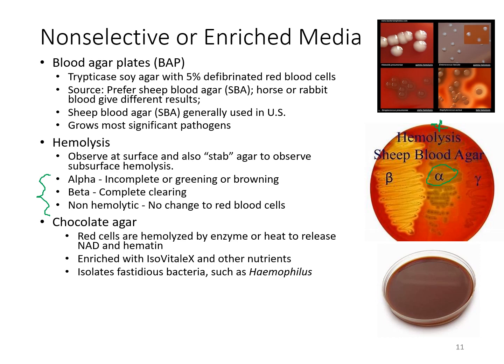Now, if you're ever unsure, you can take a culture loop and just scooch the colony over to the side and look at the agar itself to see what it looks like under that particular organism. Sometimes the clearing can be taking place, but it's under the organism. So you could scooch it to the side and look at the clearing of the agar if you're unsure. But typically you can just hold it up to a light source, hold it up to the sky, and look through the agar and look for that clearing.